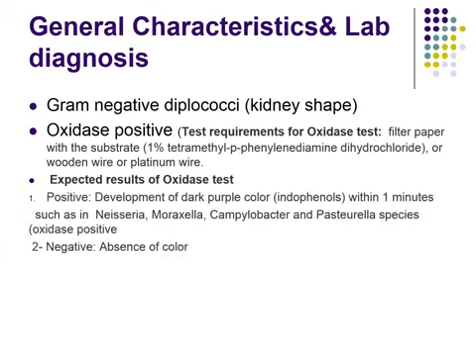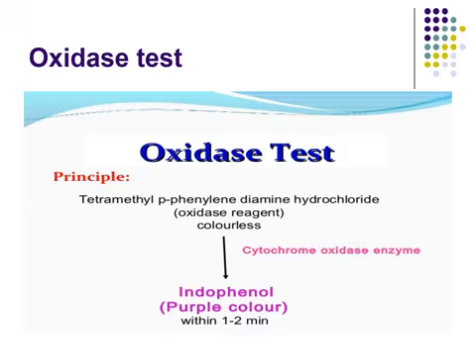In case of a positive result, a dark purplish color develops within 1 minute. Many bacteria other than Neisseria also give a positive result.